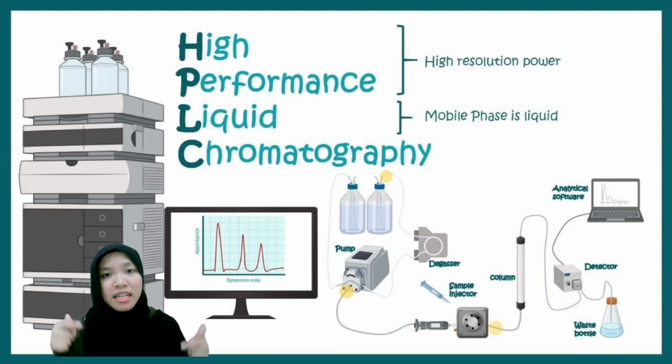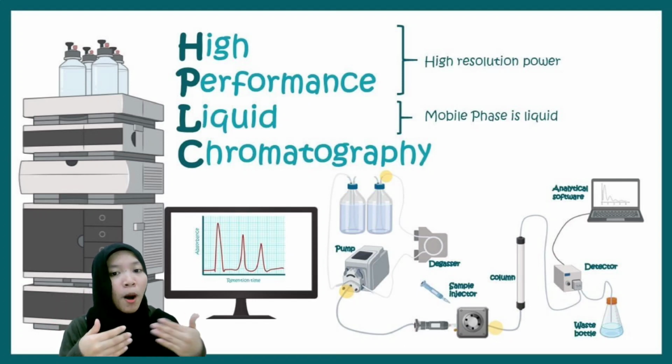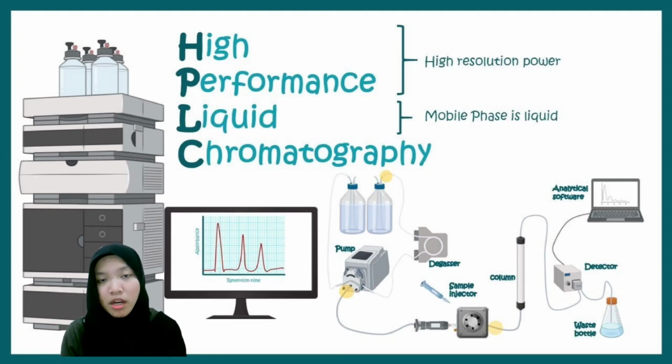Only compounds dissolved in solvent can be analyzed with HPLC. HPLC separates compounds dissolved in a liquid sample and allows qualitative and quantitative analysis of what components and how much of each compound are contained in the sample. The mobile phase is delivered to a separation column, which contains the stationary phase, and then to the detector at a stable flow rate controlled by the solvent delivery pump.